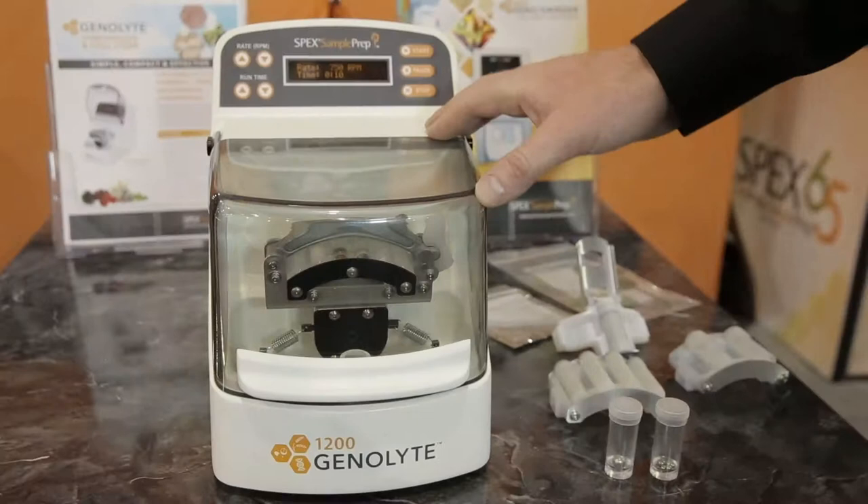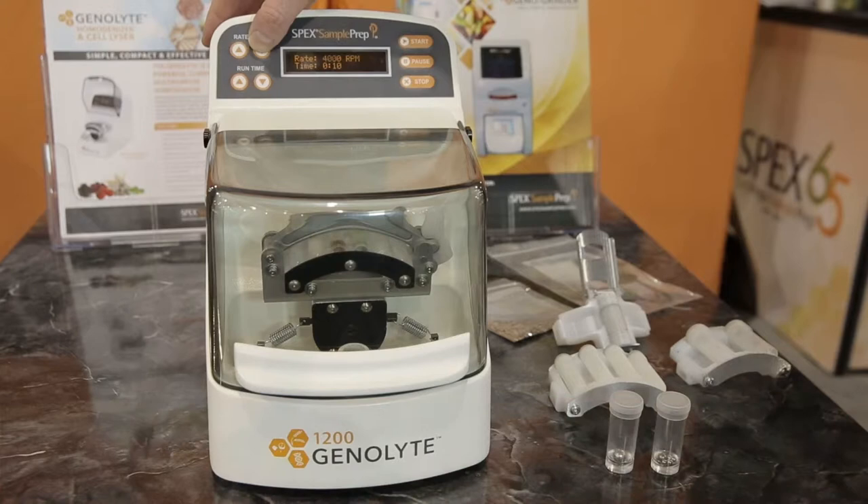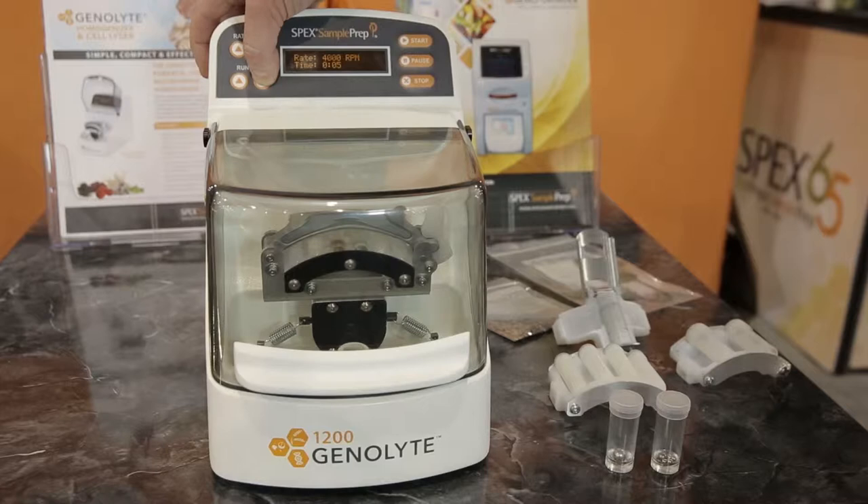The GenoLyte has very simple controls. We have the rate, which we can change from 750 up to 4,000 RPM, and then we have the time, which we can set in five-second increments. Here I'm just going to set this back up to 10 seconds and change the rate down to 750.